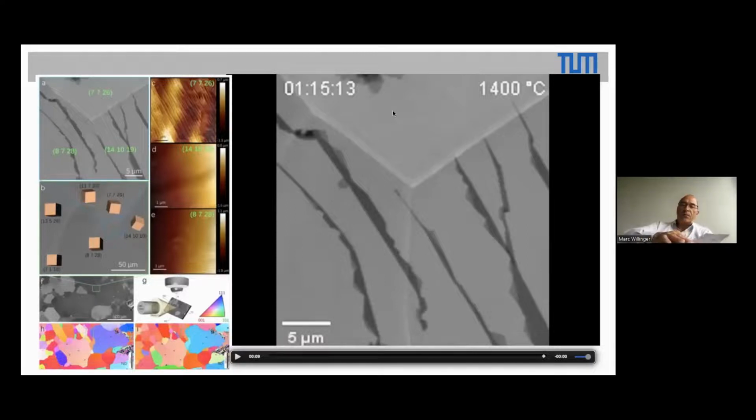When the wrinkles fold over, you have not only a monolayer, but you have three layers. The bottom layer folds backwards and back up, so to the left and back to the right. So in the middle, you have three layers that give this dark contrast.